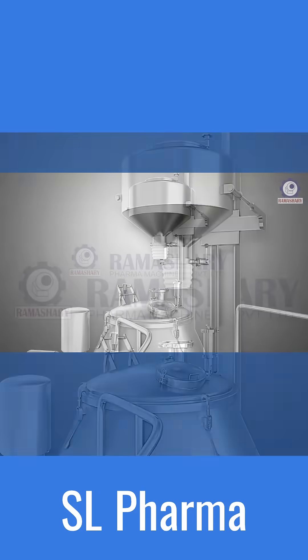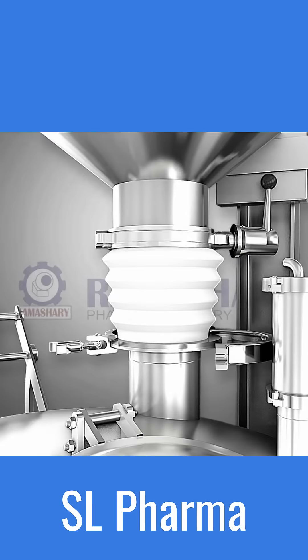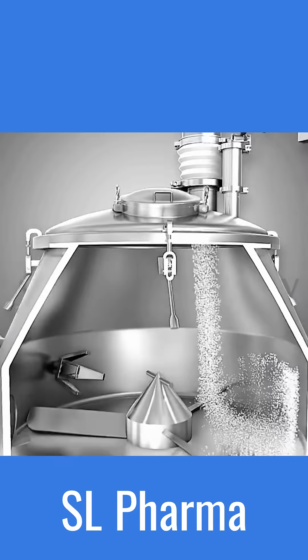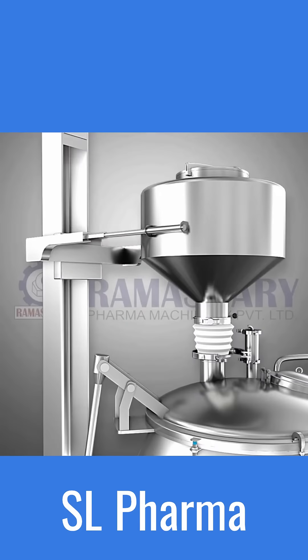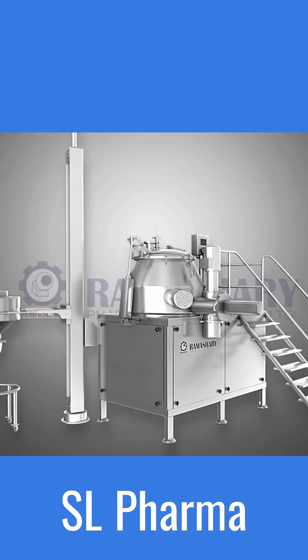The powders to be mixed and granulated are loaded into the lifter bin and positioned above the mixing chamber, with the discharge outlet of the bin aligned with the charging inlet of the RNG. The discharge outlet of the lifter bin is opened, allowing the powders to flow into the bowl. Once the correct amount of powders have been added to the RNG, the discharge outlet of the lifter bin and charging port is closed.